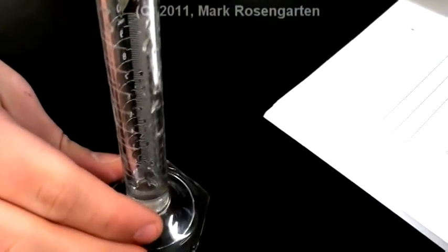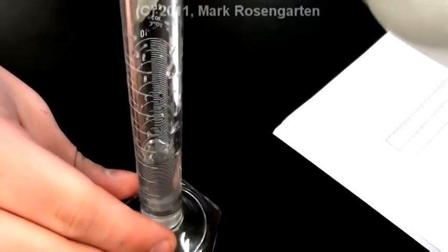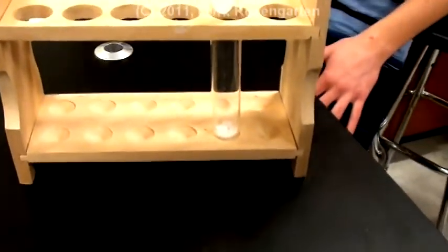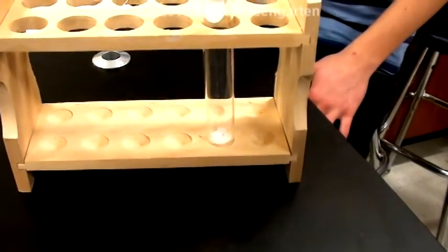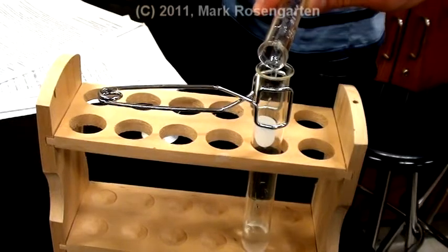Next, measure out five milliliters of distilled water into a graduated cylinder. Next, add the water to the salt in the test tube.